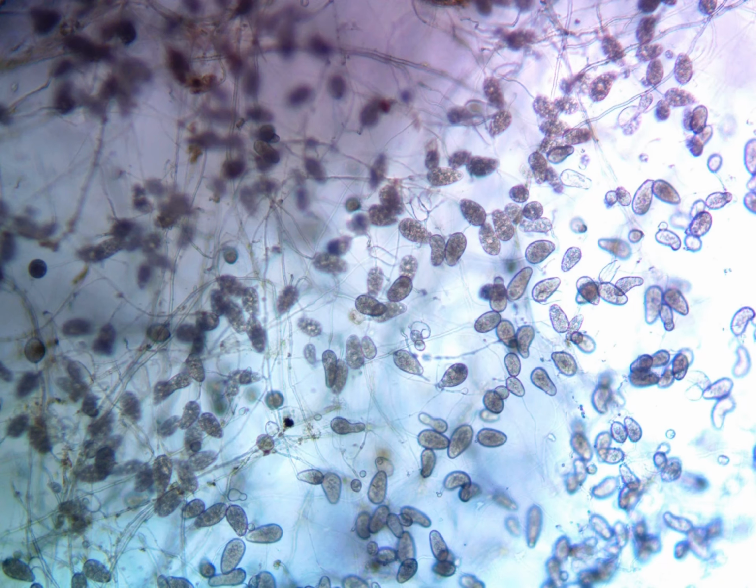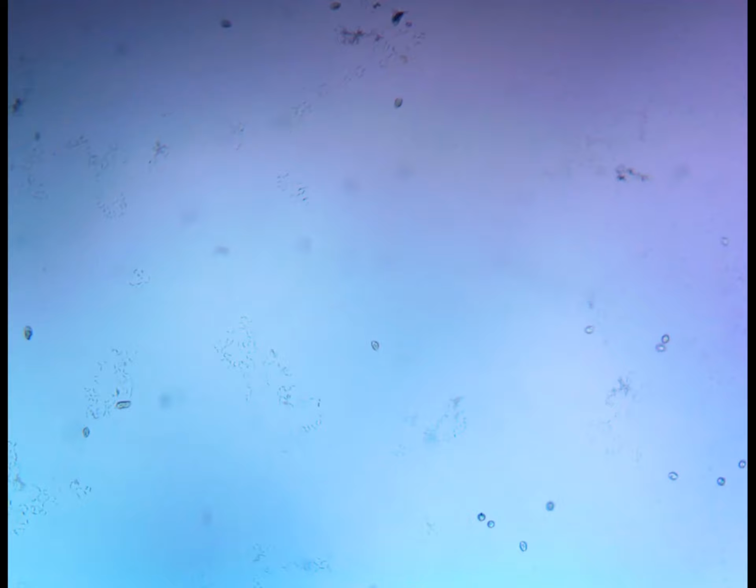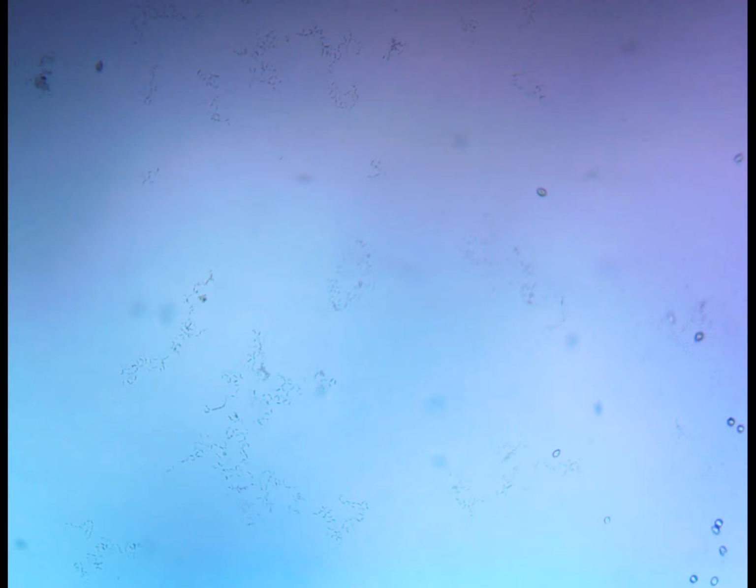One thing that allows Phytophthora to be a good pathogen, and which can allow us to use baiting as a tool to detect it, is the fact that under favorable conditions, a lot of sporangia can be formed. These are all sporangia of Phytophthora niederhauseri. You can see that they're mostly not released at this point. In this bit of video, we're seeing what happens in a liquid solution where zoospores have been released. They seem to swim around somewhat randomly, with a random pattern of search, but then they home in on chemical signals that show them that there's something they're potentially interested in colonizing.